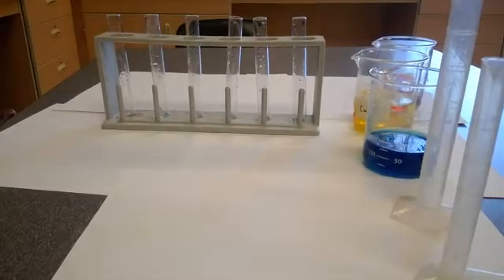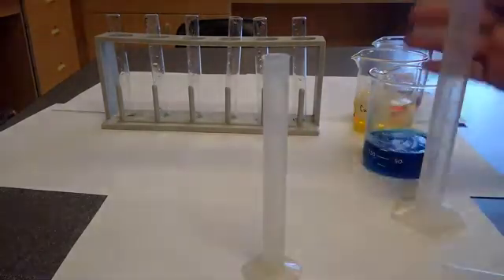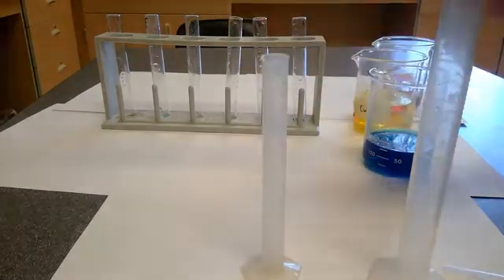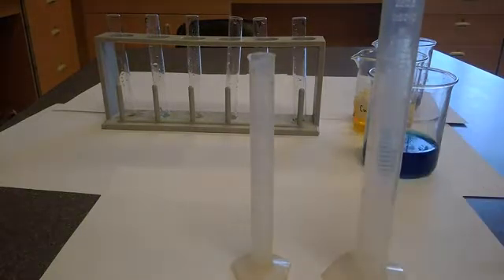All right, step number 3 said that into test tube A, we're going to measure 19 milliliters of water. I have 2 graduated cylinders here. This one only records to a maximum of 10 milliliters, so I'll have to use this one. One thing that I have to note on this one is that I have to make sure that I'm reading the grades that go up accurately. It records in half milliliters.